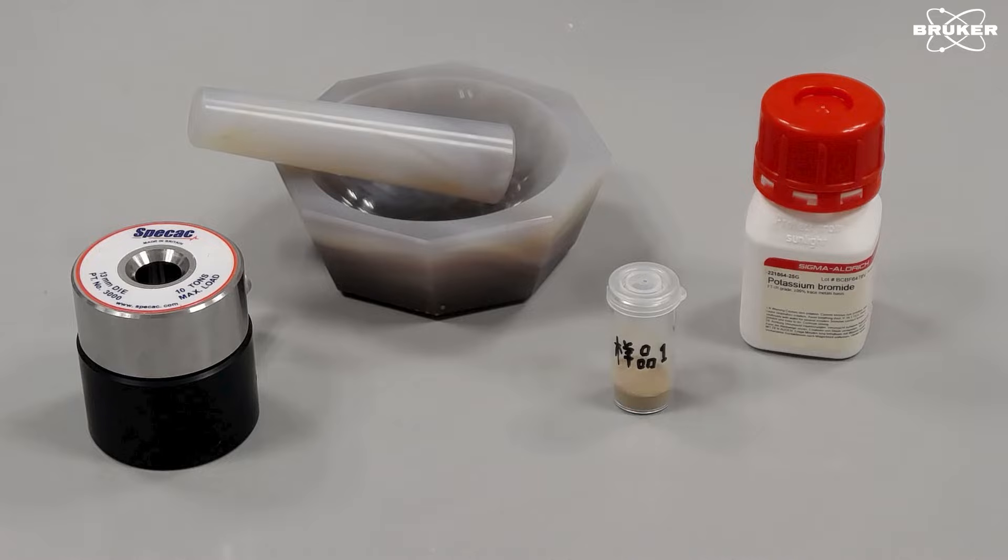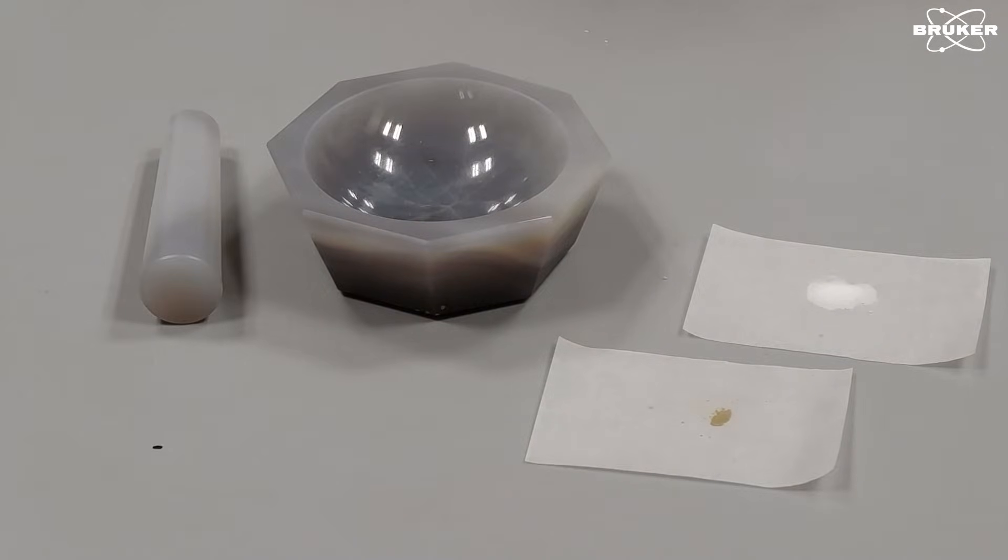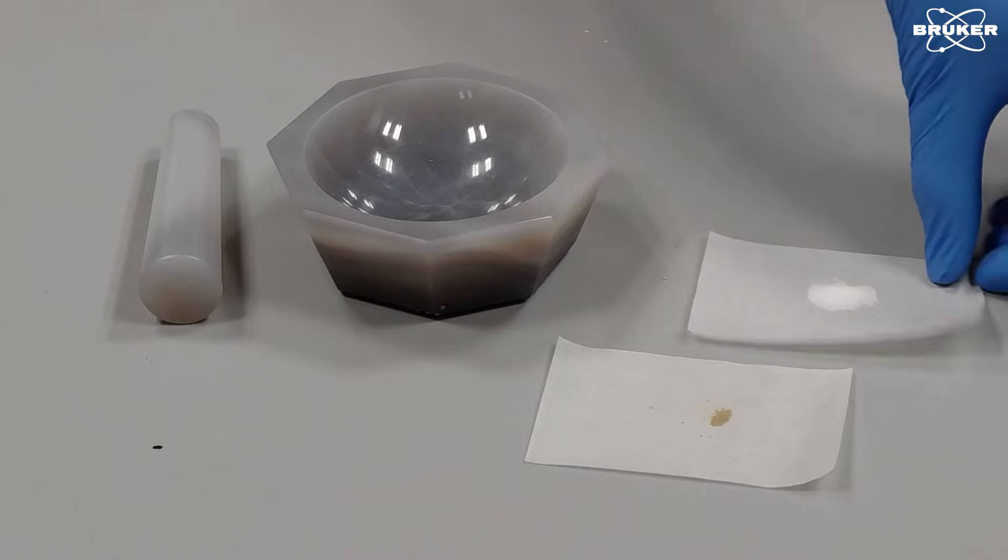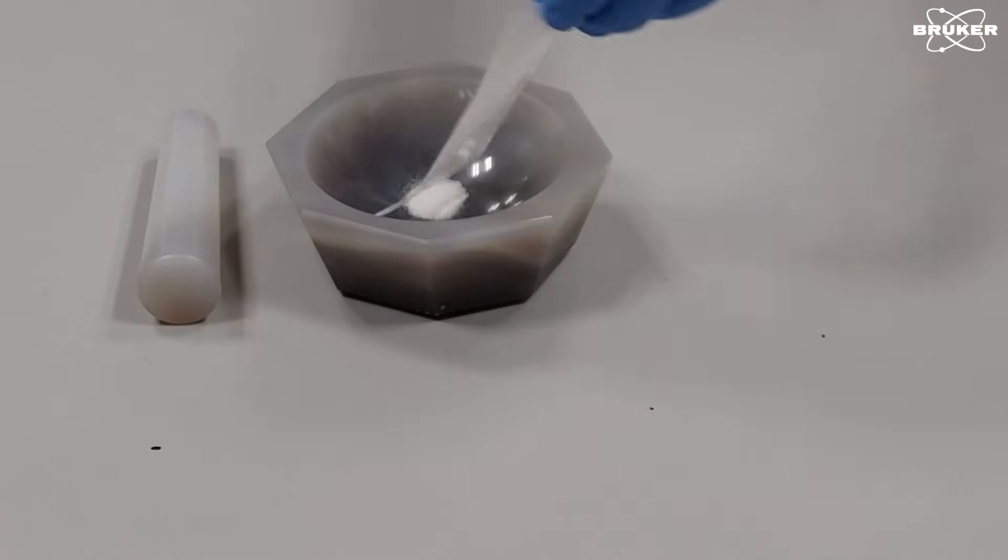First we weigh in KBR and sample. Please note that using too much of your sample can lead to bad IR spectra. It's best to adjust the sample concentration to your sample, but a good rule of thumb is about 0.5 to 2% of sample per weight.